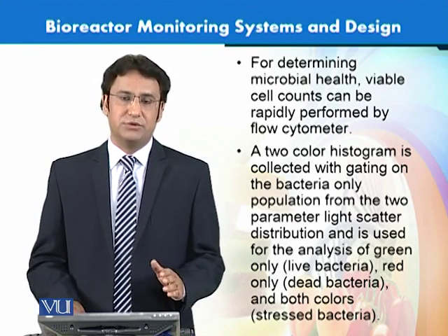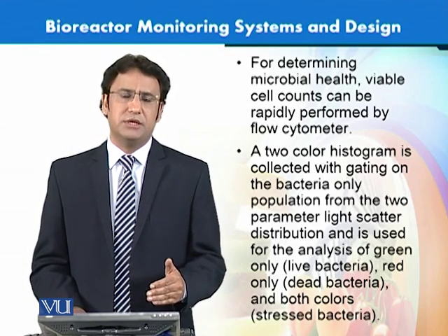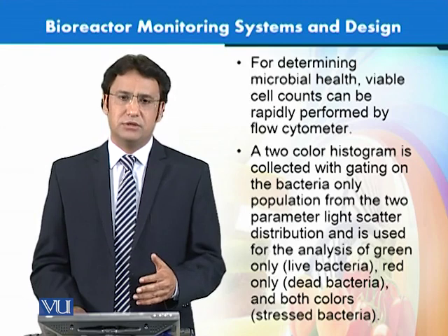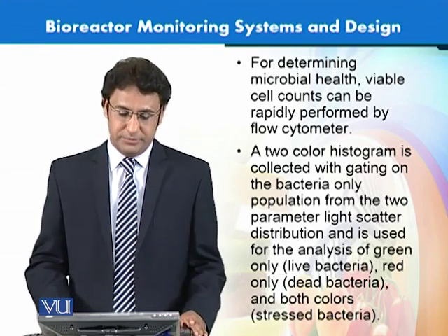So in this we can actually quantify and look at the ratio of live organisms, dead organisms, or the microorganisms which are stressed in the real-time fermentation.